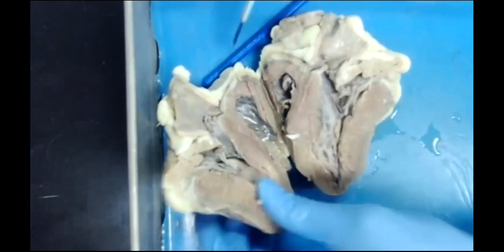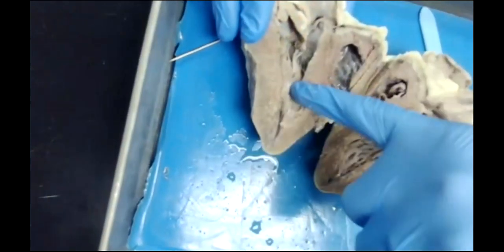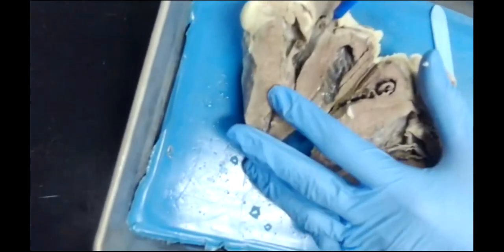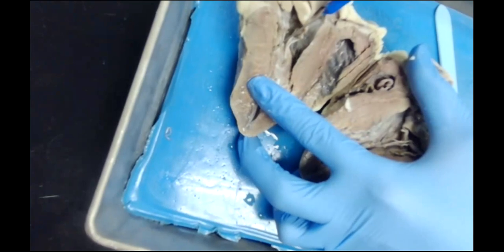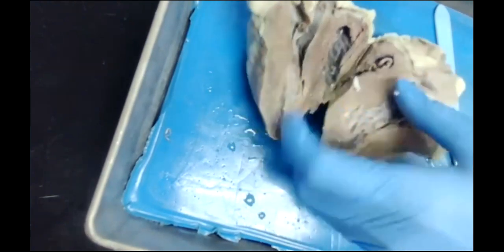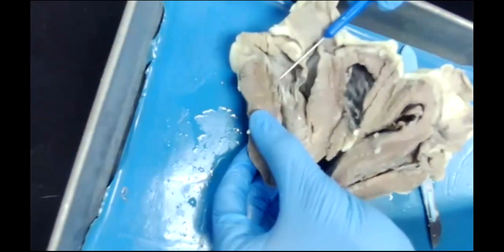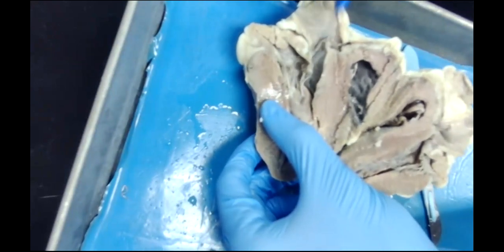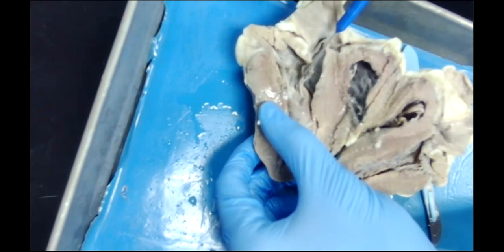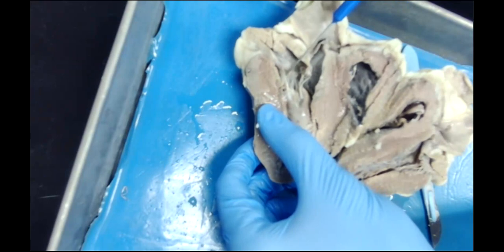Okay. Now, on this side in particular, we can get a really good interior view of some of those papillary muscles. So we can see the papillary muscles connected to these structures here. Anyone, what were these cords called? Anyone remember what these were called? That connect it to the valve. So here we have the valve, and here we have these little cords connecting to the papillary muscles. What were these called? These were the chordae tendineae.